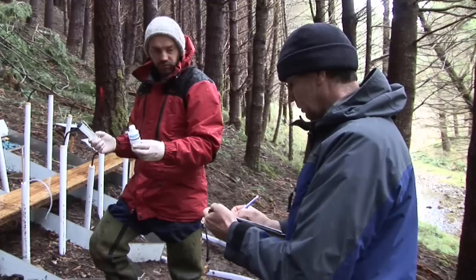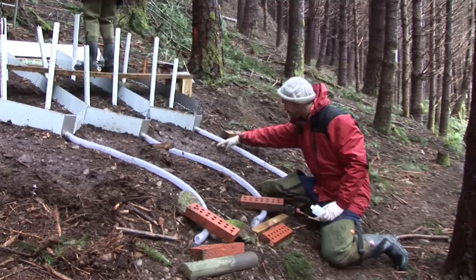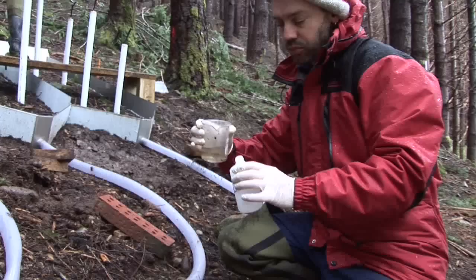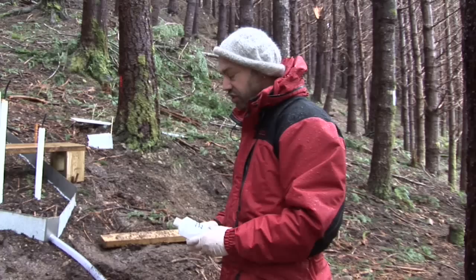This water in the syringe is all the rainwater which has hit the baits, gone into the soil, and is flowing downhill. Now we're collecting the surface runoff, which flows down the plots, flows through these tubes, and into the beakers. And we simply pour that into our bottle. So that's the overland flow sample for 2 hours. Now we're basically repeating it for 4 hours, 8 hours, and 12 hours to get the big picture of what's happening here.